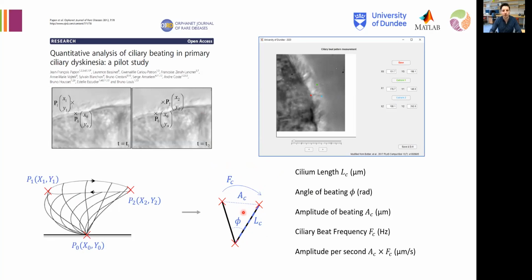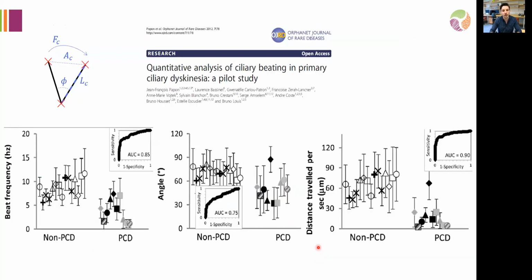In the original papers, they also look at the exact time where the active stroke starts, the exact time where it stops, and the time of the little pause that you have between the start of the recovery stroke and the start of the next active stroke, etc. So it was 3 points and 5 time points. I do not get the 5 time points in Dundee, but be aware that you can get even more parameters with this type of analysis.